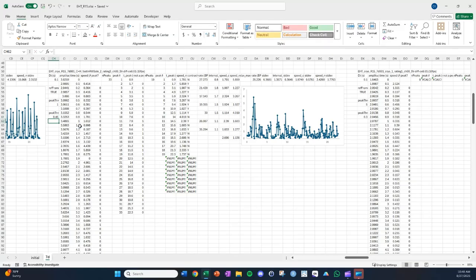And I anticipated this being a hard one to change. So it looks like basically no matter what we do here, it's not going to be analyzing this in a way that actually makes sense with the data. So what you have to do is more time consuming, more manual, and is actually go into this. And one thing that's helpful here is to identify how many peaks you think there are. It's kind of hard with this, but I'll look at how many beats I think there are.